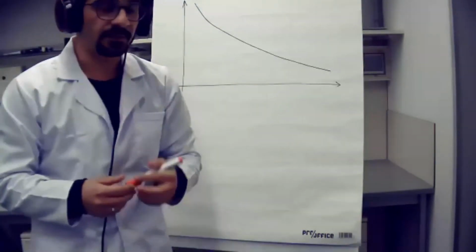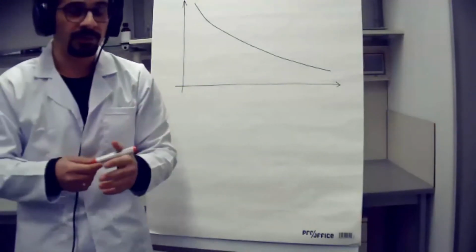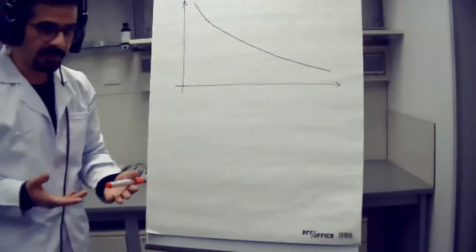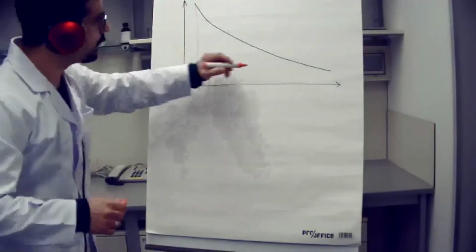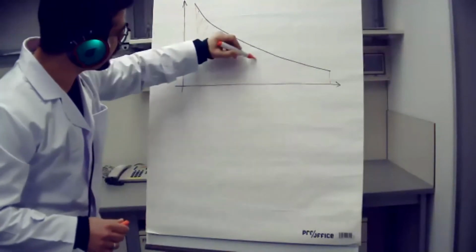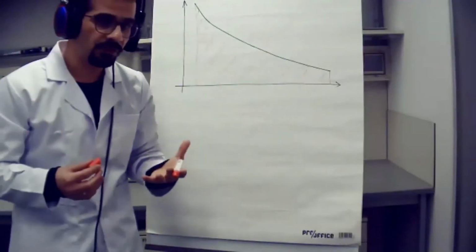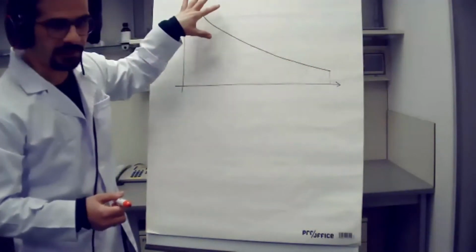What is the intensity? That's the difference that we are doing this measurement. What is important for us in FLIM is the lifetime components and the contribution in the decay curve, if there is more than one, if there are several of them. But intensity mathematically is the area below this decay curve. So that's the intensity we are measuring. When we are doing normal fluorescence microscopy, what we are actually measuring is the intensity. It's the area below the decay curve.